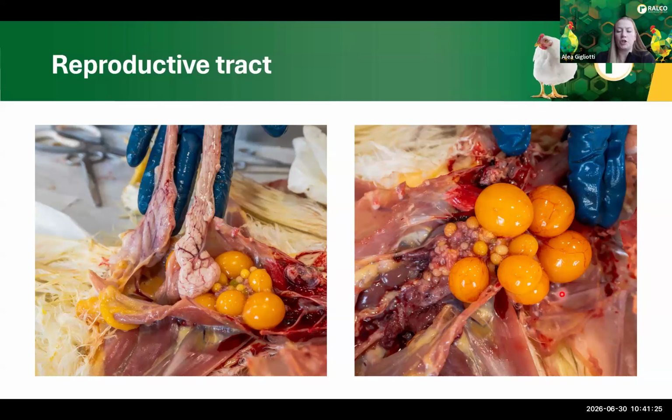This is kind of showing that progression of each. So each of these little small, beady circles or spheres are going to eventually become the yolk of an egg. So you should see as they mature, they do get bigger, and once they reach a certain size, I mean, that's the size of the yolk that you'll see in an egg.